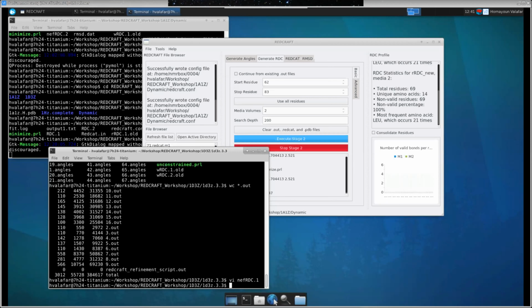So if you really wanted to automate this whole thing, you could do it that way, but you can just do it manually. For example, run residues 1 through 10, get a structure, do the rest of your work in Explore, get a structure, translate it back, whatever you need to do from Explore to Redcraft, and then continue your Redcraft execution from 10 onward.